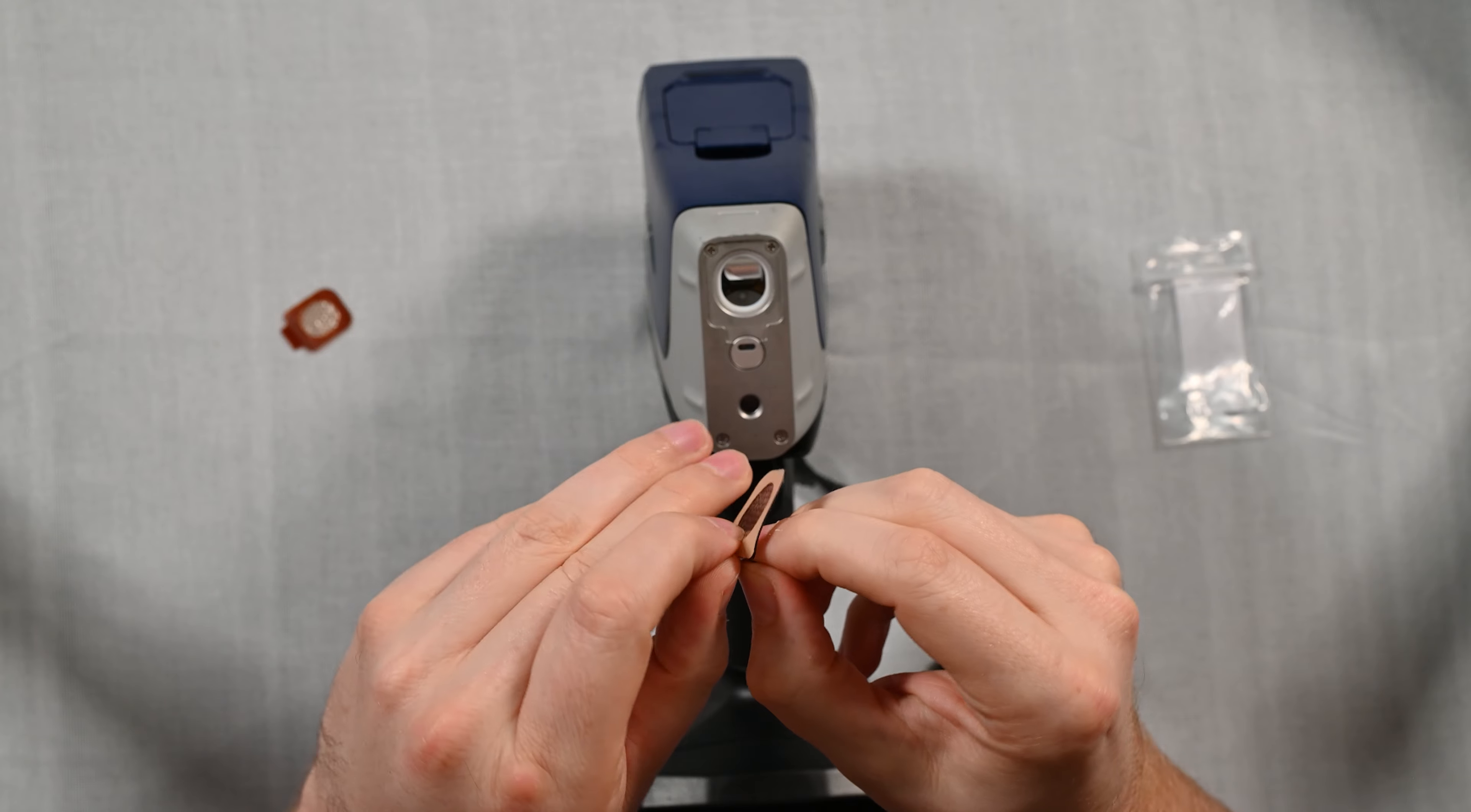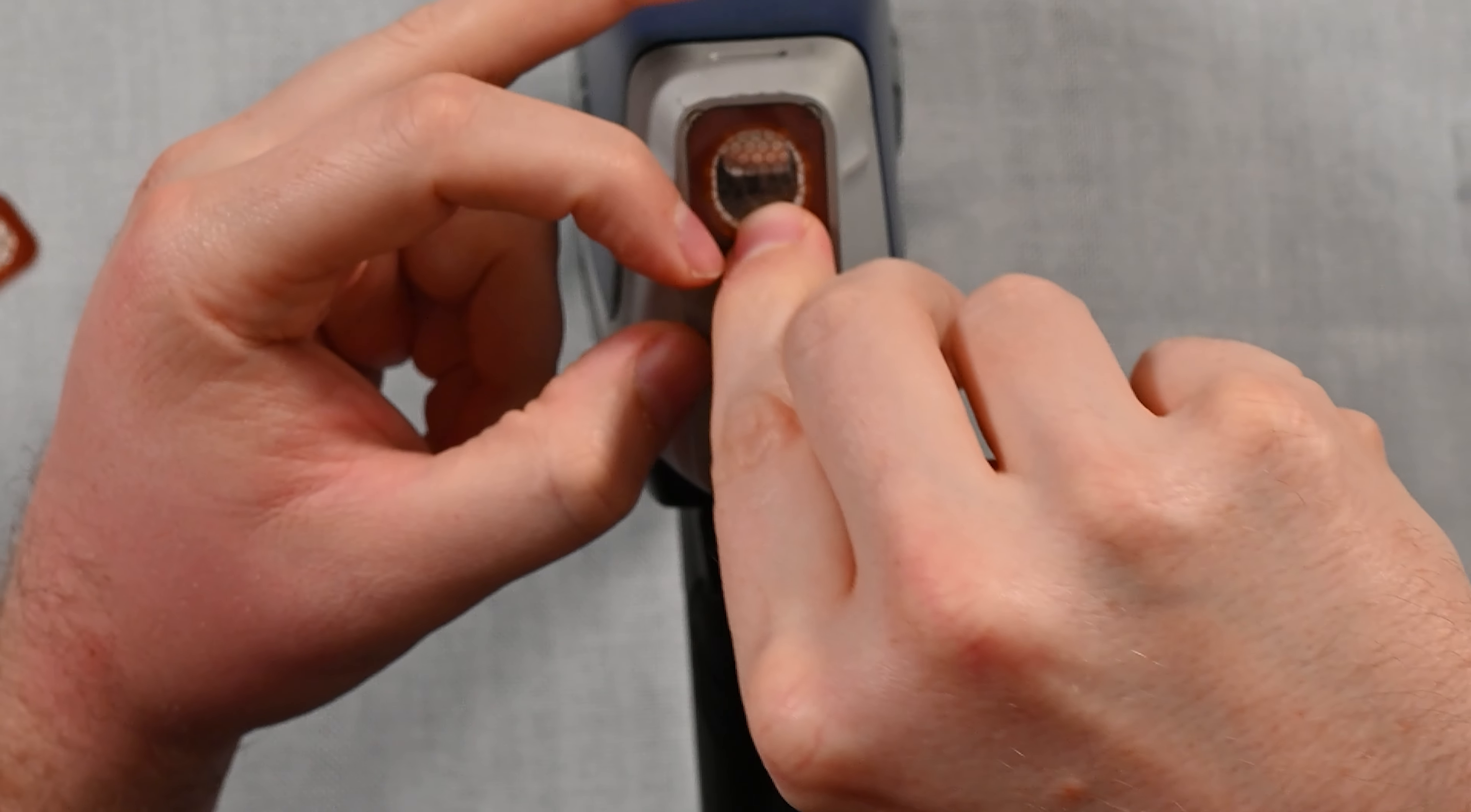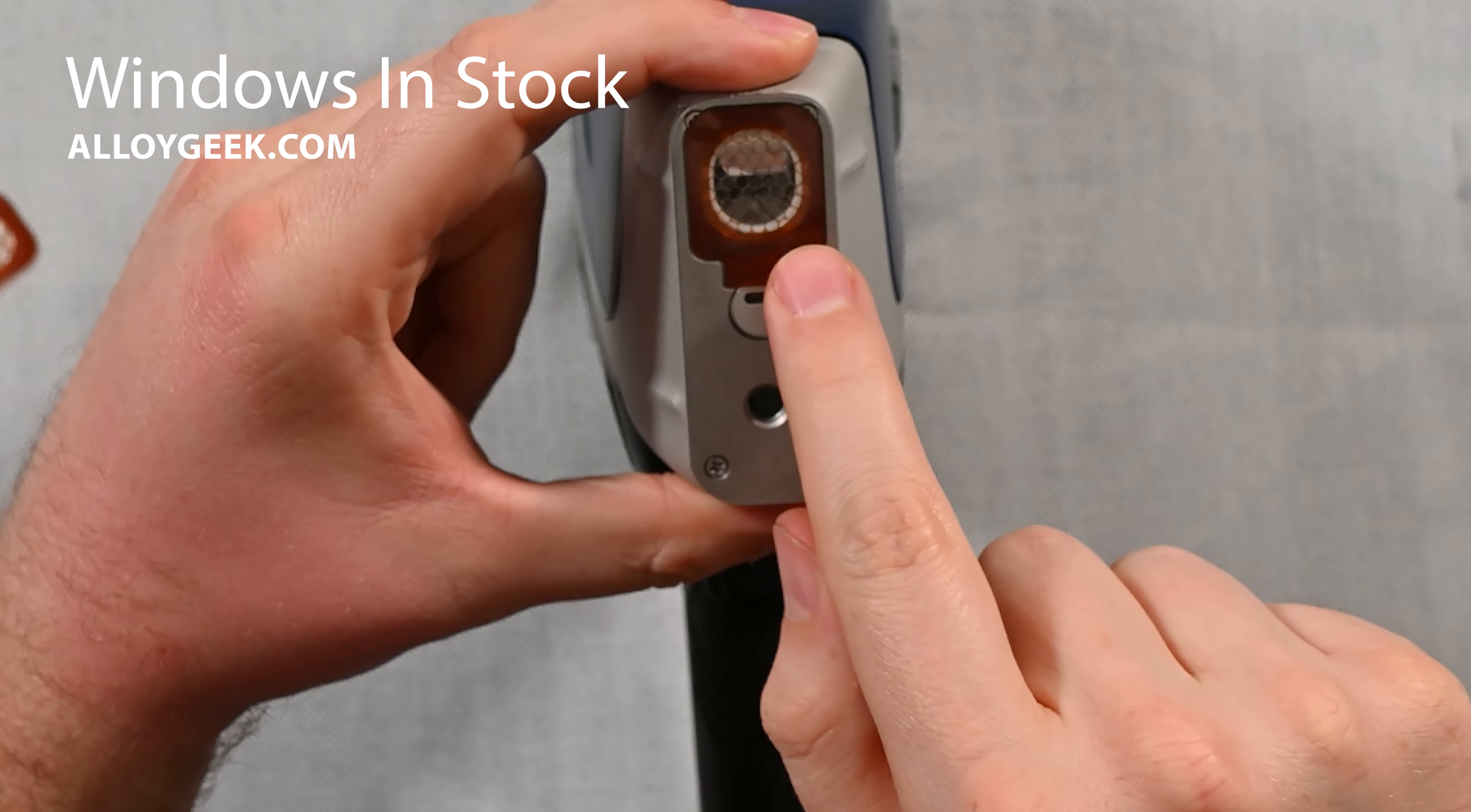On the back there will be this area you can peel away which will reveal the adhesive, and now it's a matter of alignment. It takes a little bit of finesse to get it in the right spot but it's actually pretty easy. There's a beautifully machined groove there that holds the window and it fits perfectly in that space.